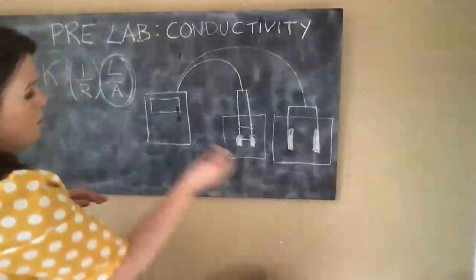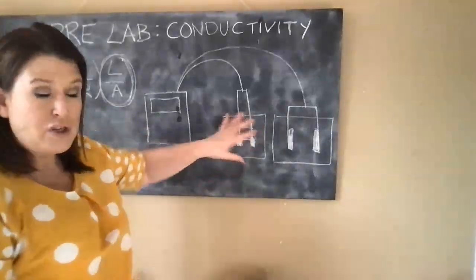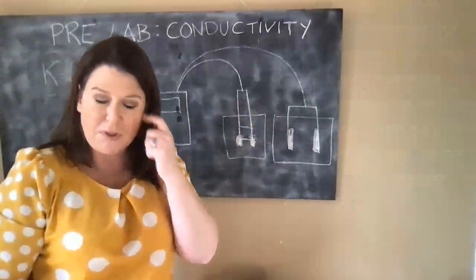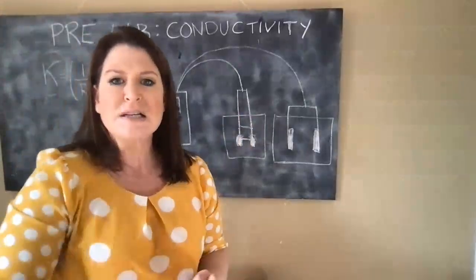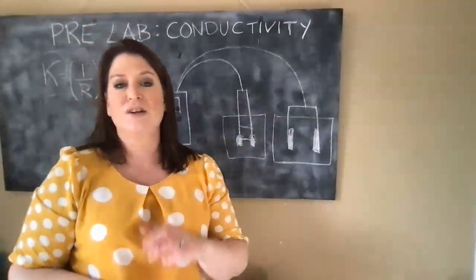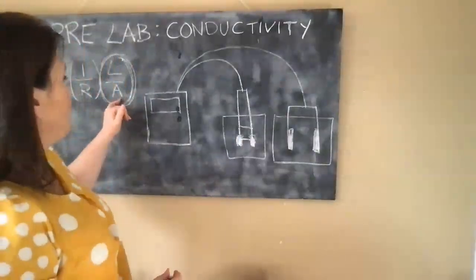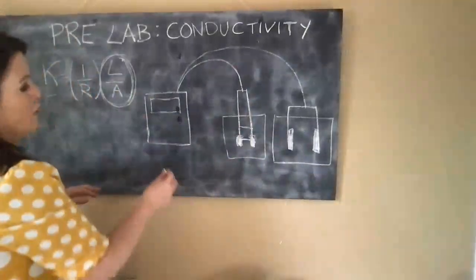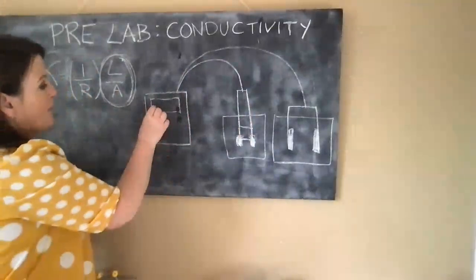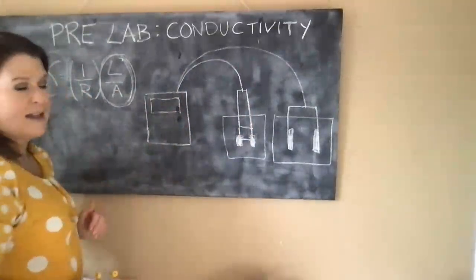Now, for our solution, there is going to be a KCl solution, 0.01 molar, I think. Just remembering that I have that right. So 0.01 molar KCl solution, in a water bath at 25 degrees C. When you put it in, it will fluctuate for a little bit, and then you'll get a reading, a numerical value, and you'll take that down.